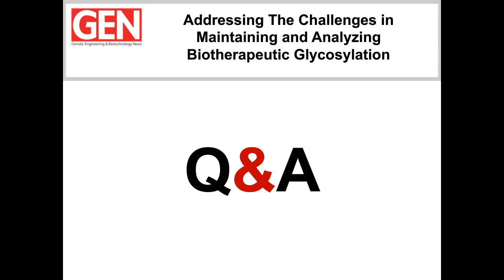Good question. Yes, you can have more than one detector at one time. You can have all 4 of them. As a matter of fact, the instrument we have in our lab has 3 detectors, which we use all the time. So yes, it's possible to have all 4 detectors at the same time and use them at the same time.